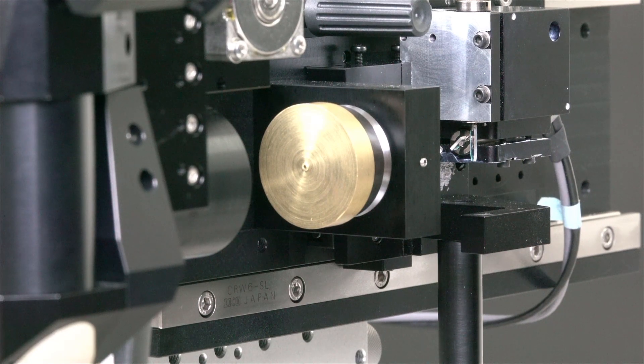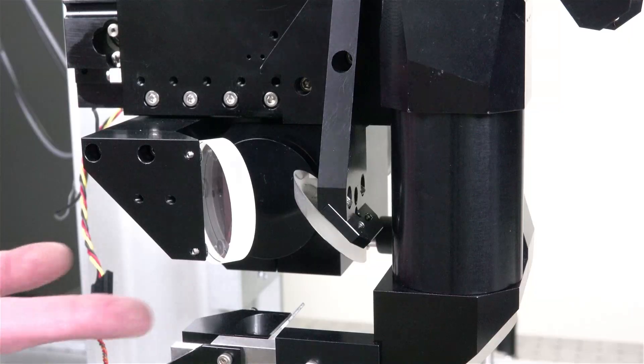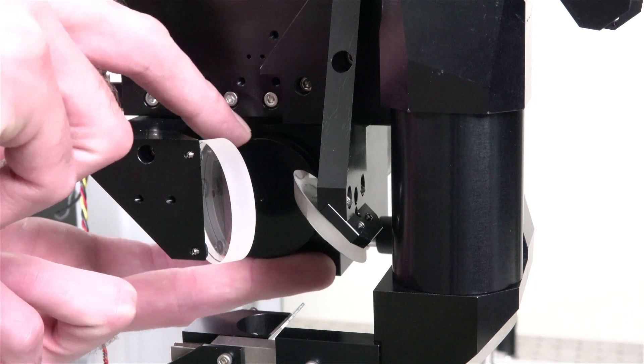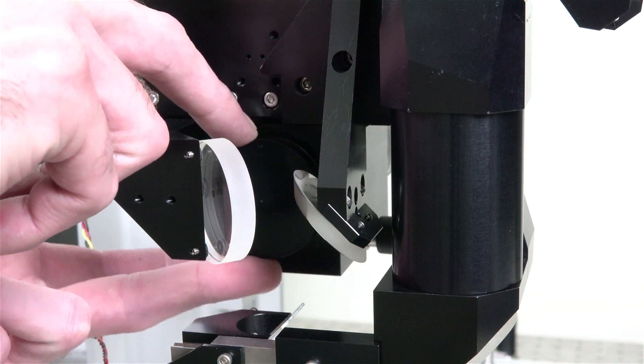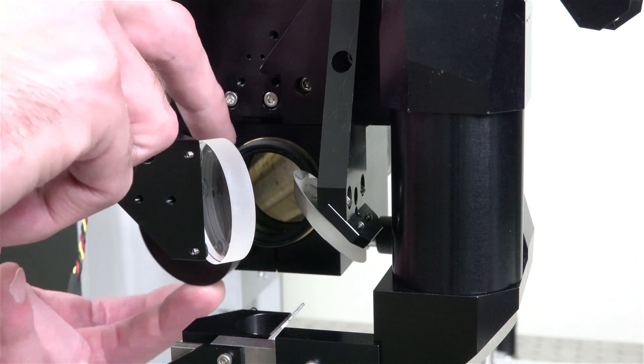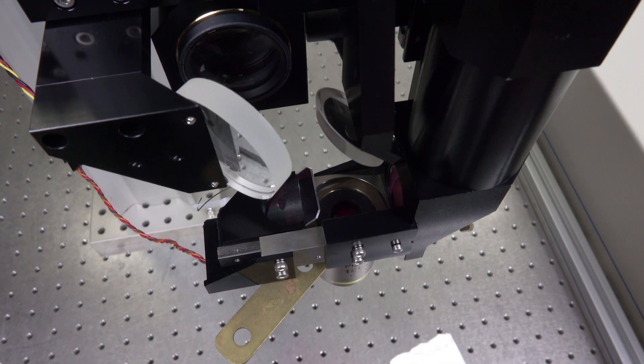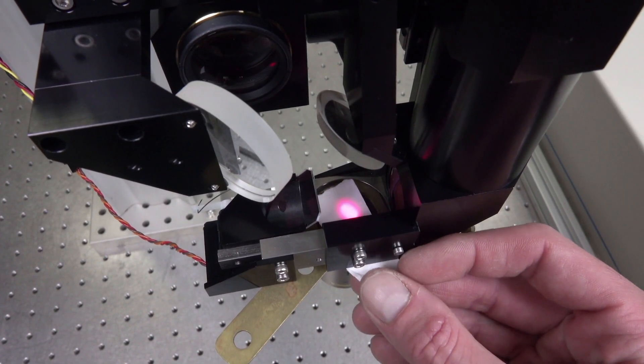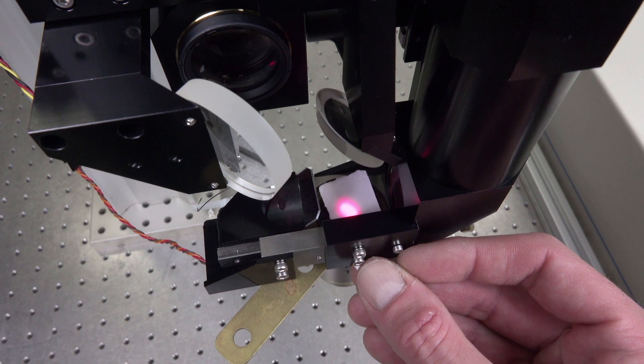The final step is to remove the alignment pinholes over the tube lens and scan lens on the back of the microscope and view the imaging beam on the back aperture of the objective. This is easily done by sliding a piece of business card or paper in the narrow space directly over the objective. This will allow you to view the shape and position of the beam.